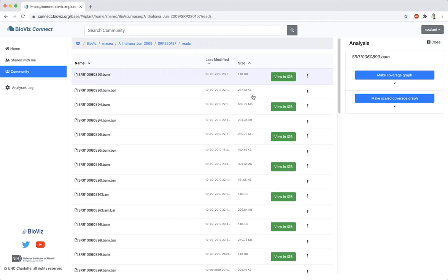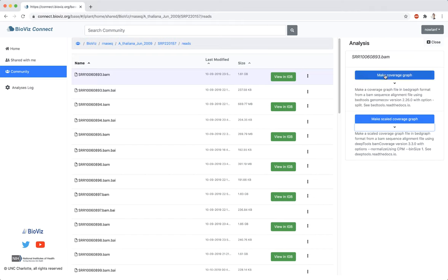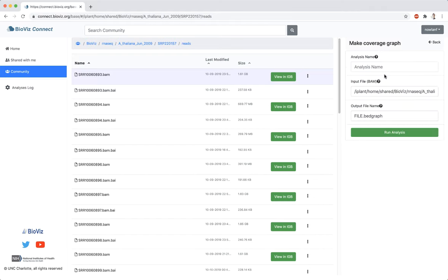In this example, I've selected a BAM file and have two choices. The first choice will make a genome-wide coverage graph. The second will make a scaled genome-wide coverage graph. I would like to make a genome-wide coverage graph, so I will select the first option.